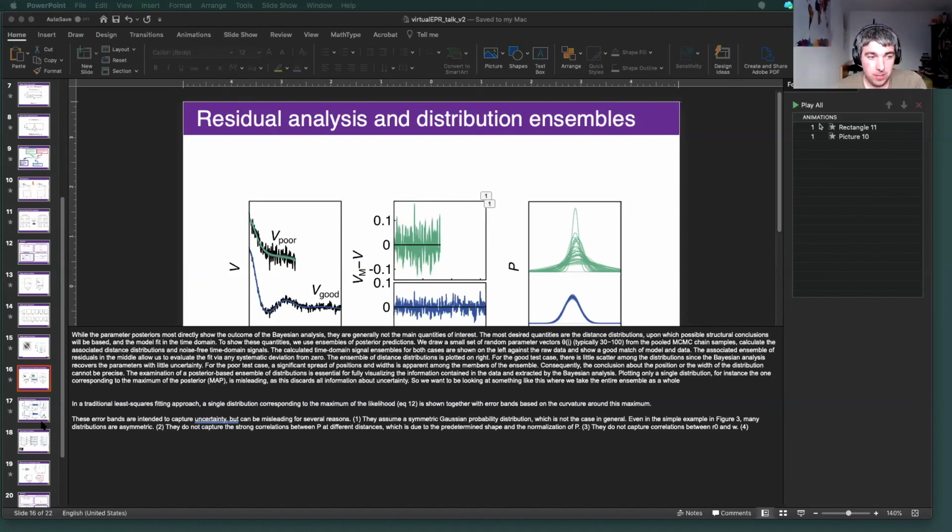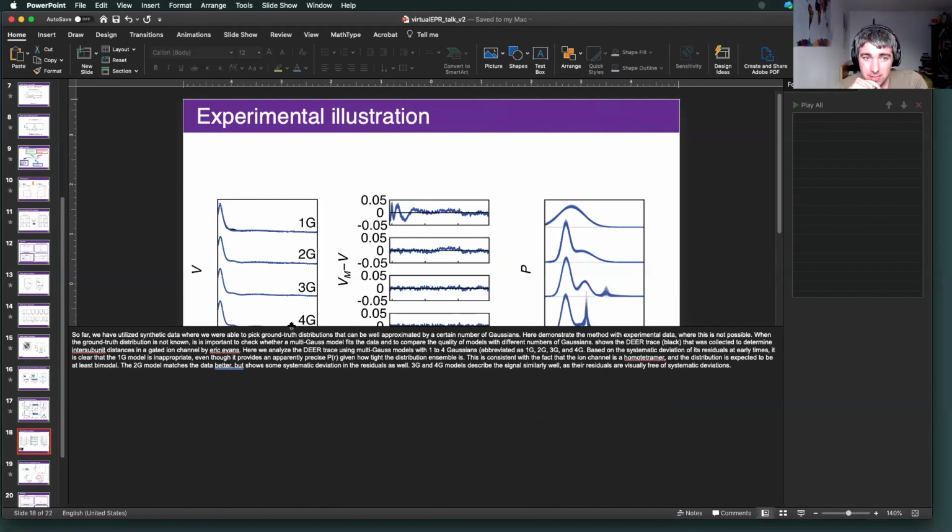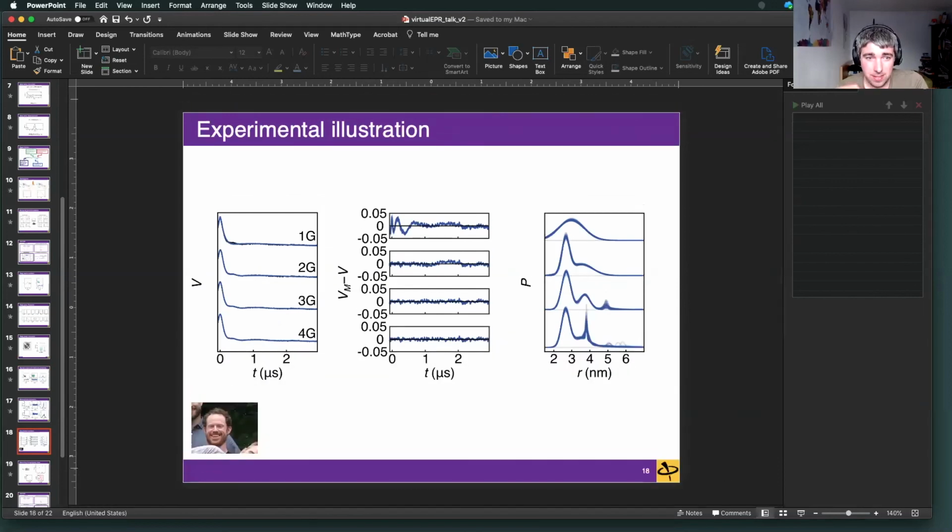Another question to your slide number 18, roughly. They showed the differences in the time domain. Have you any experience when looking at the spectral domain, the dipolar spectrum, if you get any better resolution of differences there?